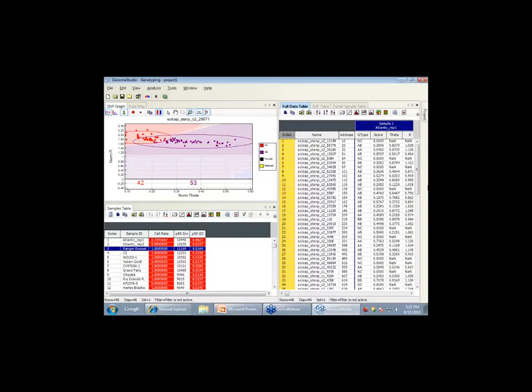Okay. So the question was how do we know where the SNPs are from? The answer is, right now the public can't know that. In 2 months, Robin will put that out. Robin knows which scaffold they're on, what the SNP is, what the base of that SNP is, and from what variety.